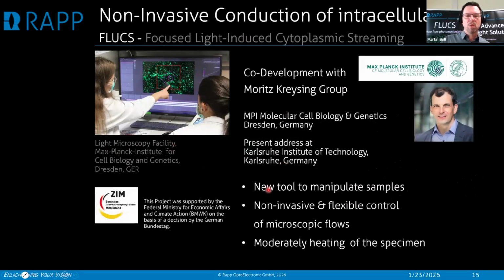This is a tool to manipulate samples. It's non-invasive and different, but similar to optical tweezers. And it works by moderately heating the specimen. How does it look like? What can we actually do?